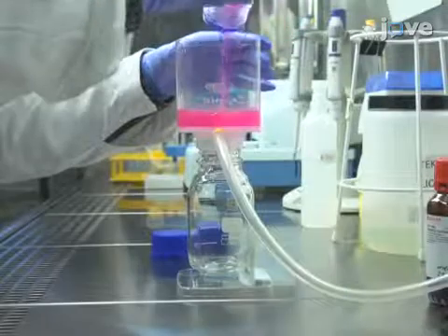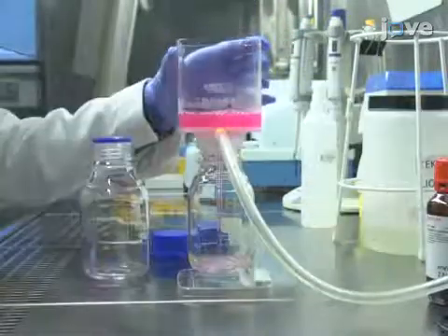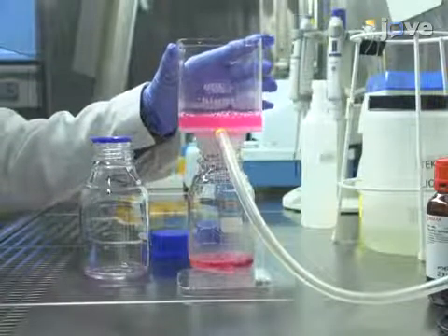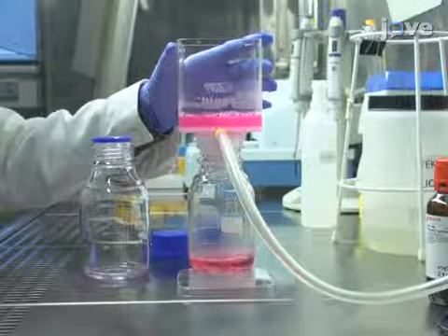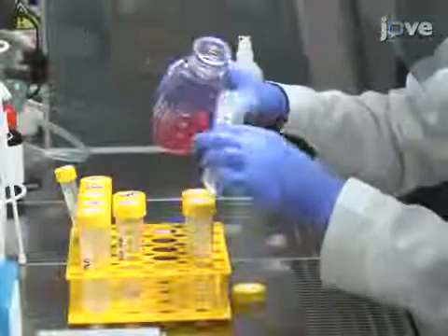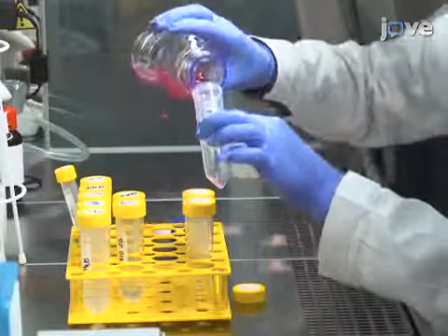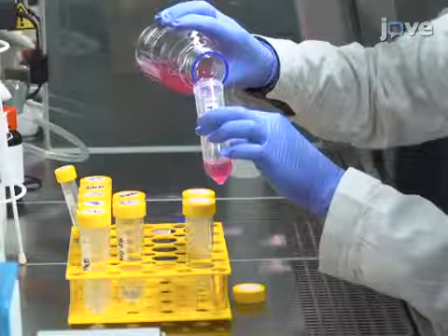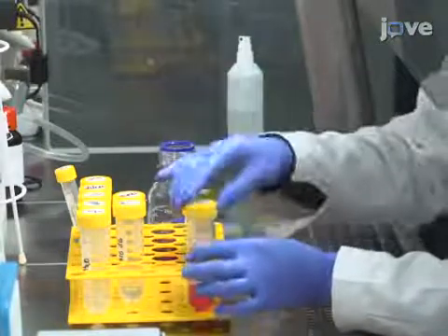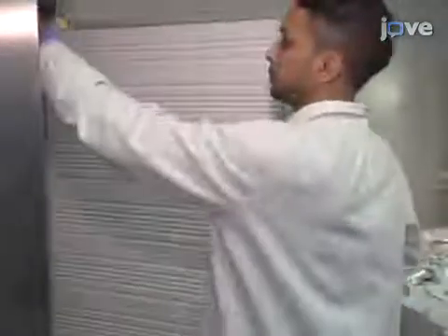After allowing the autoclaved agarose to cool to about 70 degrees Celsius, filter it through a 500 milliliter 0.22 micrometer bottle top filter in a laminar flow box. If the entire solution will not be used at once, aliquot it. Store this ready-to-use agarose solution aseptically in a cold room or 4 degrees Celsius fridge for up to 4 weeks.